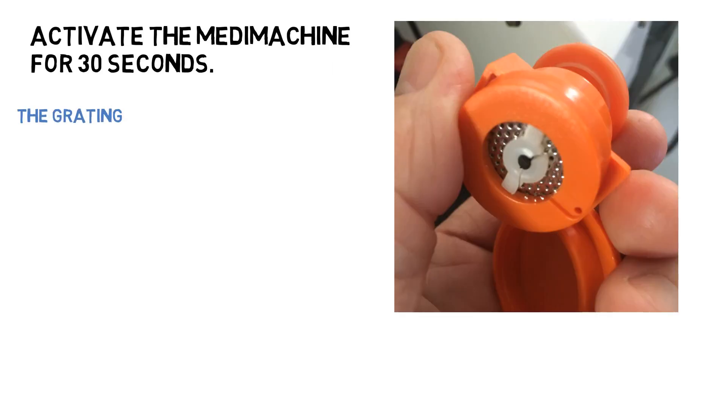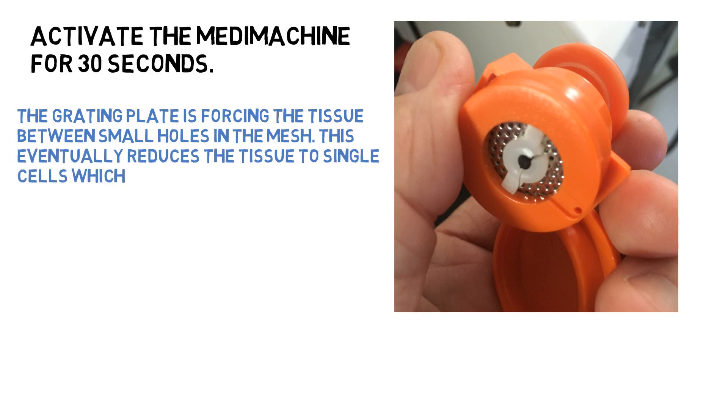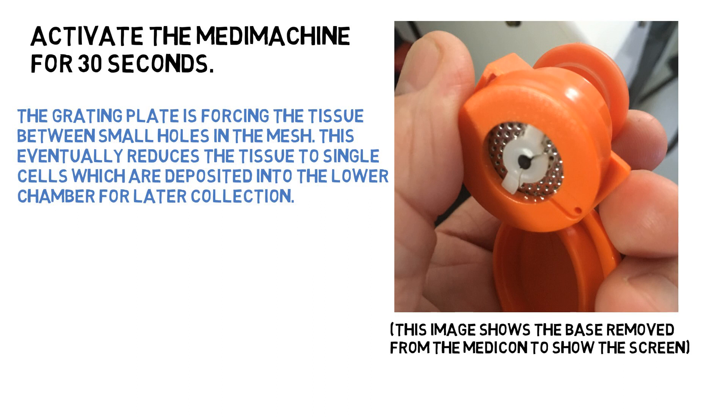We removed the base from this unit so you can see what is inside. The grating plate spins, chopping up the tissue and allowing the single cells to be deposited into the liquid below the sieve.